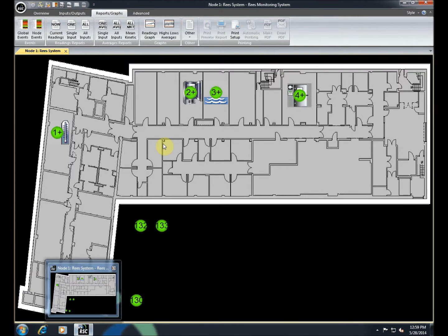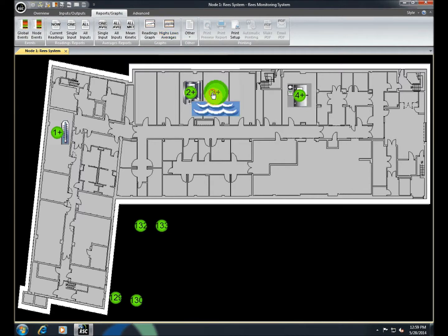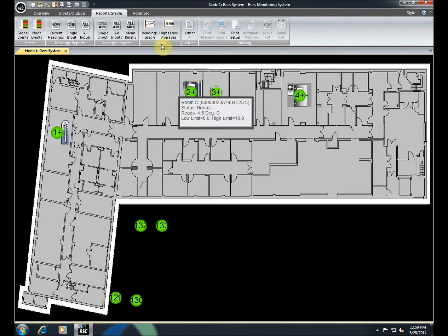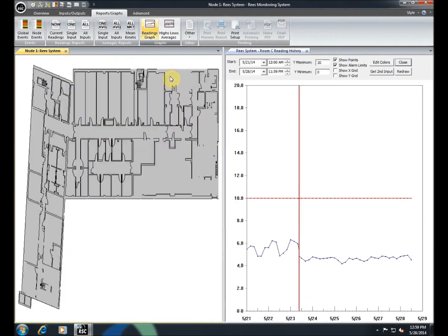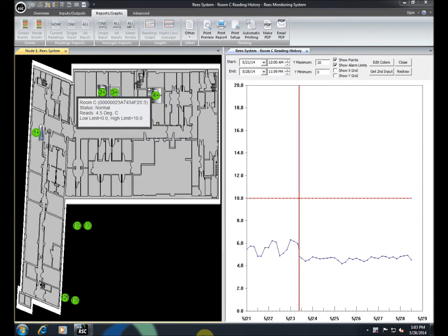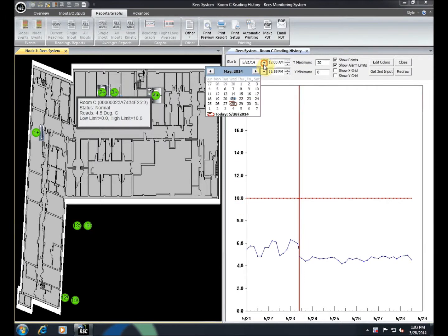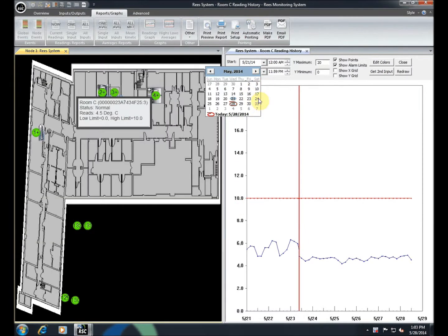If you wish to see this data in graphical format, click Highs, Lows, and Averages, or select an input and then Readings graph in the Graphs section. You can adjust the time period and axis scales to your needs.